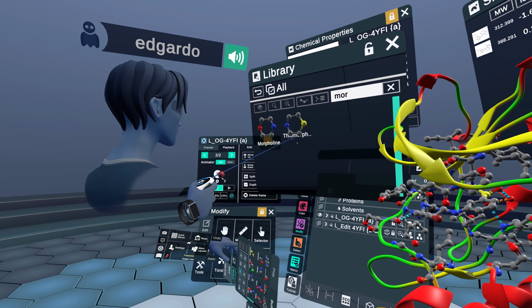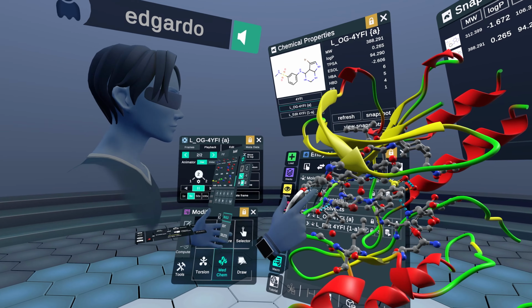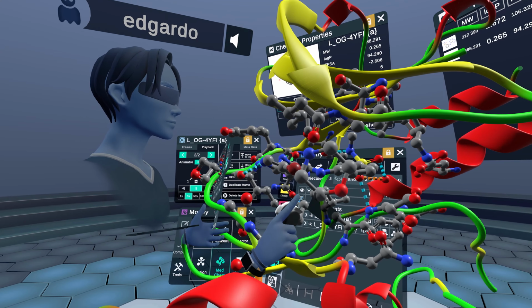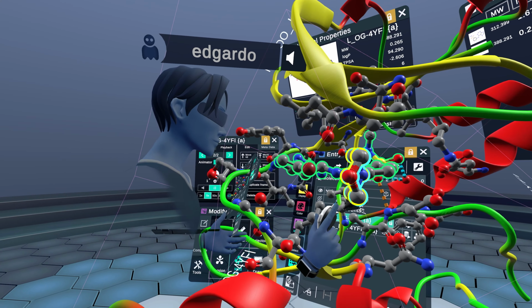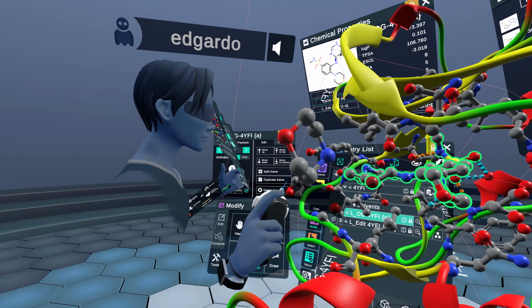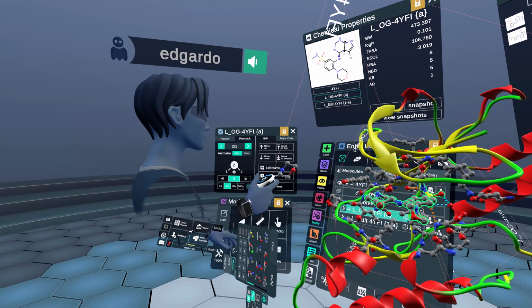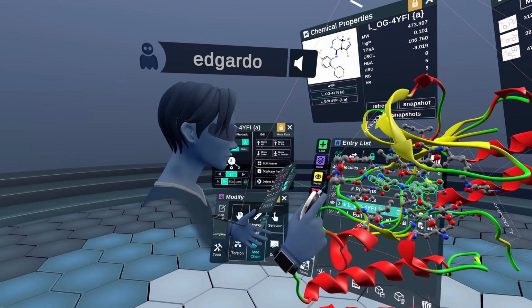You can see you don't even have to type in the whole thing, and it shows up here. I'll close this, rotate this with my joystick, position, click and drag, and perfect. Then we'll take another snapshot of that and duplicate the frame again.